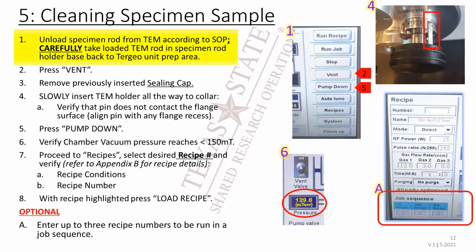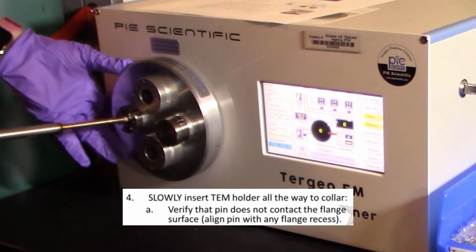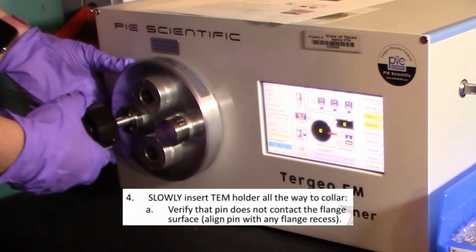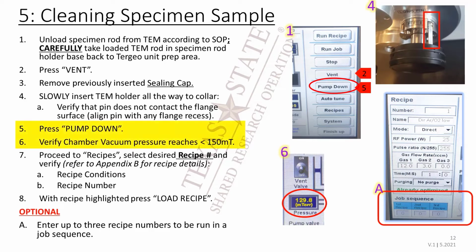Insert your TEM rod with the specimen into the holder base and go to the Tergeo unit prep area. Select Vent, remove the previously inserted sealing cap, and slowly insert your loaded TEM holder all the way to the collar. Verify that the pin does not contact the flange surface. Select Pump Down and verify chamber vacuum pressure reaches less than 150 millitorr.